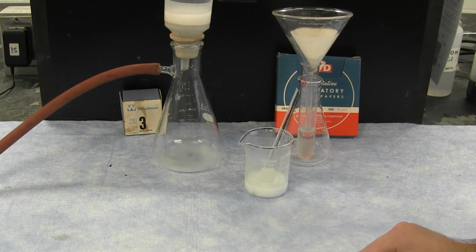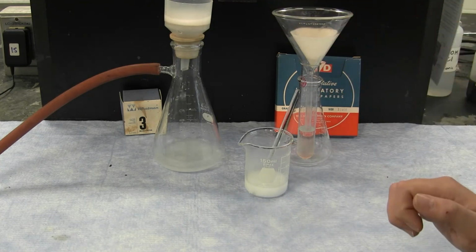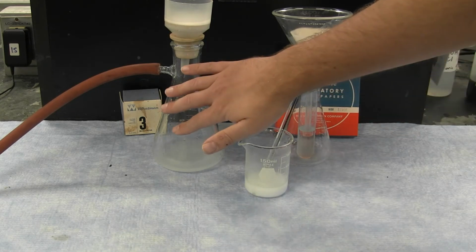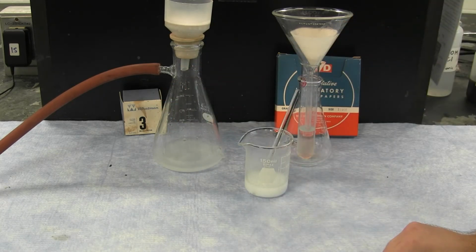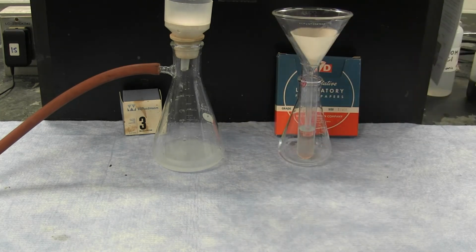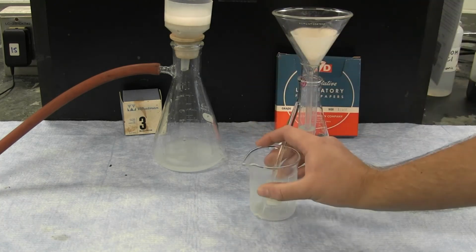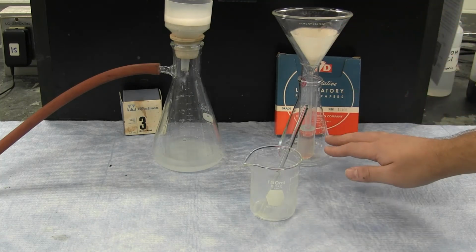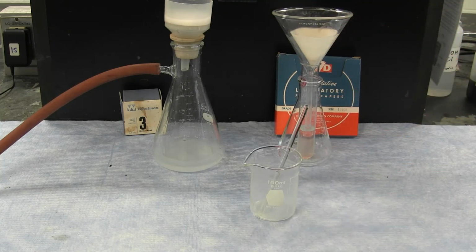Vacuum filtration is a much faster form of filtration. However, the special use of the Buchner funnel and the capability of pulling a vacuum on a glass container such as this is required. In many types of lab settings, a vacuum filtration would be used to more accurately collect the solid, where the gravity filtration will be used more so to look at the filtrate or the liquid passing below.